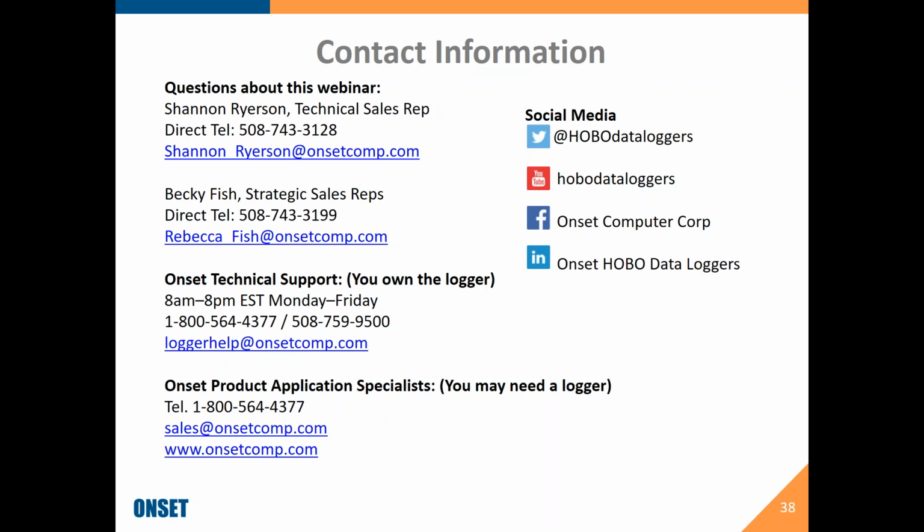From there, you can get an idea of how frequently you really need to get out and service the loggers and clean that electrode and make sure everything's working properly and you're still getting accurate readings. In that point, you'll most likely be able to space out your visits. We have customers with such a range of applications that some of them are going out every 2 to 3 weeks to clean the electrode, and they're actually getting some good lifetime out of it, 4, 5, 6 months.